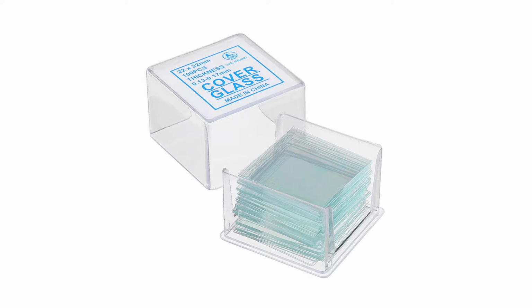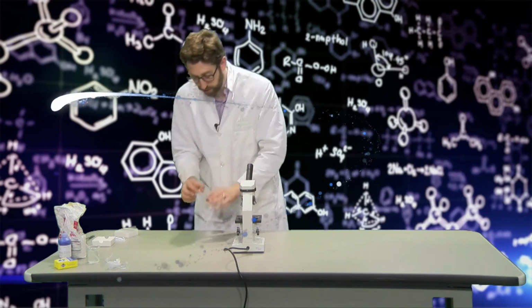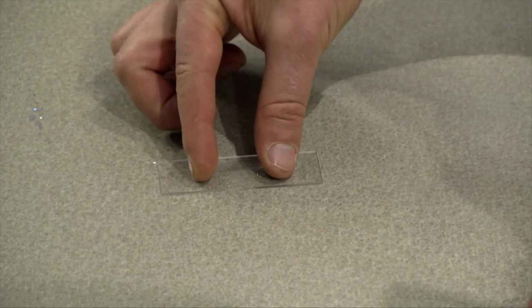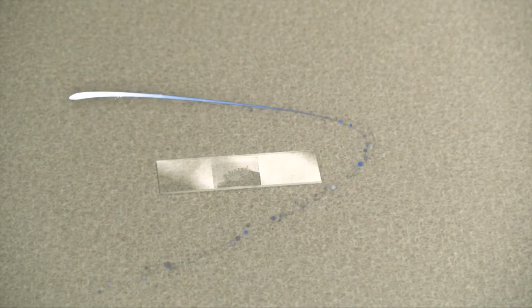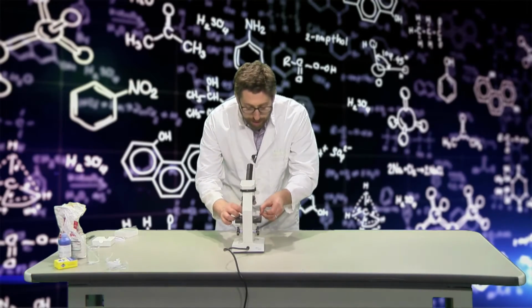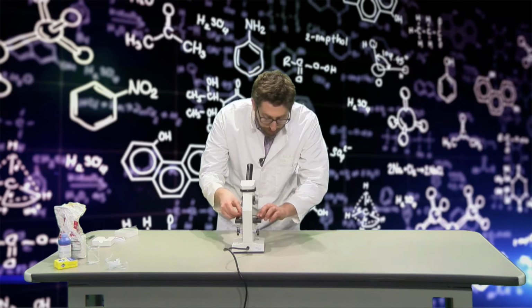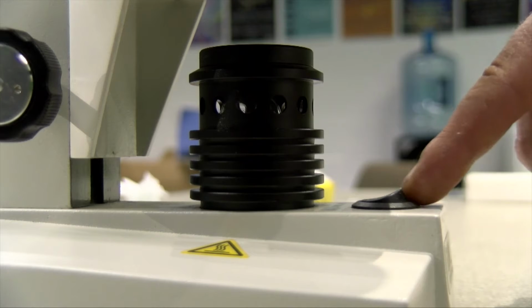This is so small you can probably barely see it, but it's a teeny glass square. I'm going to take my glass square, lean it on top, drop it over, and there we go. I have a wet mount slide. Now, I put this on the stage of my microscope and make sure my sample is directly over where the light comes in.